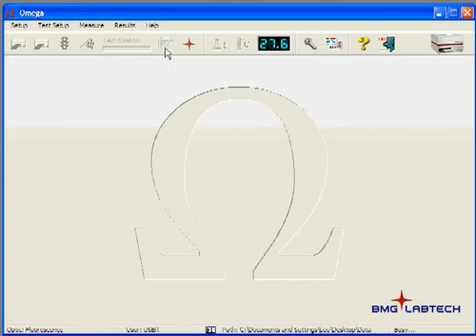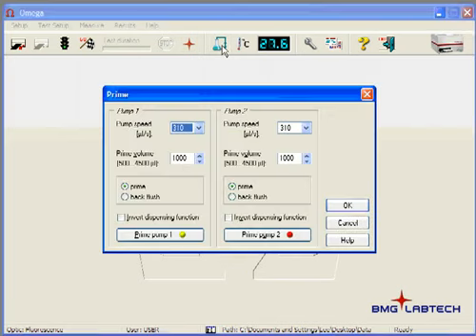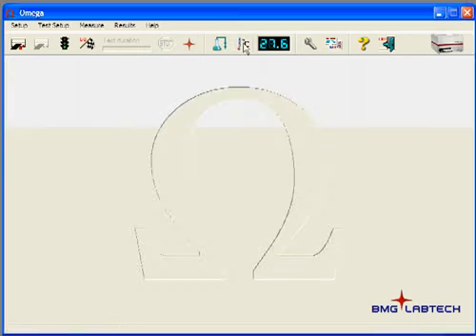The next icon across obviously is a stop button that will stop a test, and the test duration, how long the test run is going to run for. This icon here is the data analysis software called Mars that we use for doing analysis on runs that have already been done. This icon here is our priming software that allows you, for both reagent pumps here, to choose the speed, the volume, and to backflush and prime those pumps.